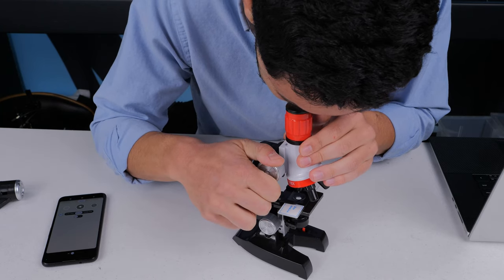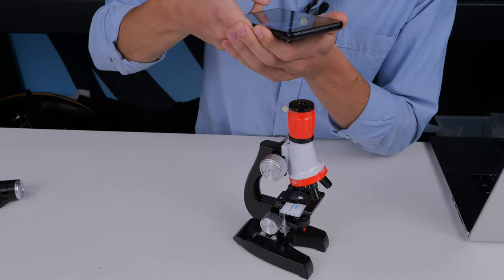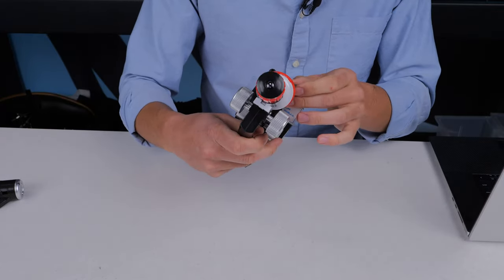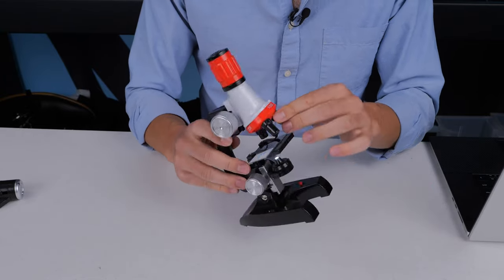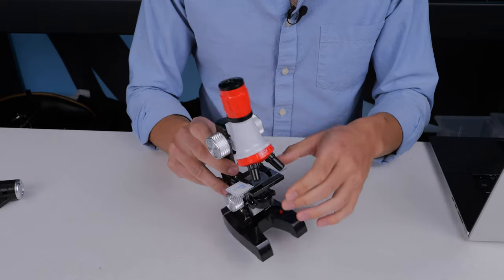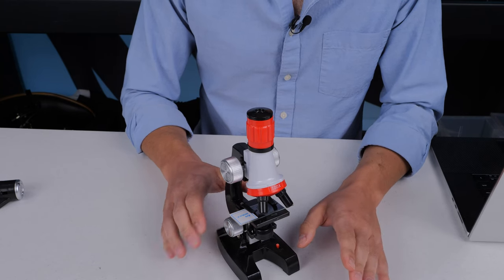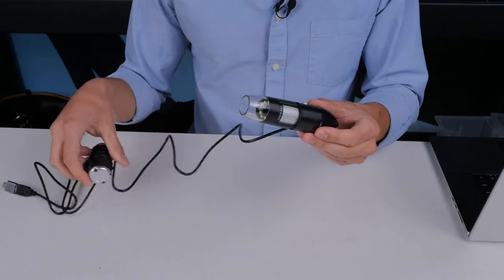After struggling to get an image — and this is what it looks like to my own eyes too — we finally got it: boom, we can see individual cells! That was at only 100 times magnification as claimed, which is total nonsense — it was probably about 50 times magnification. This one I definitely can't recommend. If you're going to get a compound microscope, you'll want to spend more than $20. Spend that $20 on a smartphone or USB microscope instead.